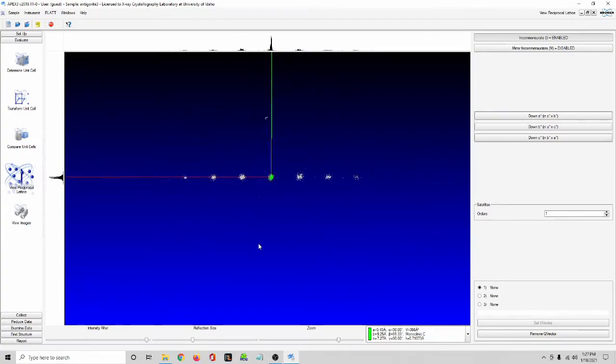If there was more than one order of modulation, it would look like the twinning did, with extra rows of spots in different directions. A 6-dimensional one would look just like another lattice here in 3 dimensions, but we only have one, which is going in this direction.